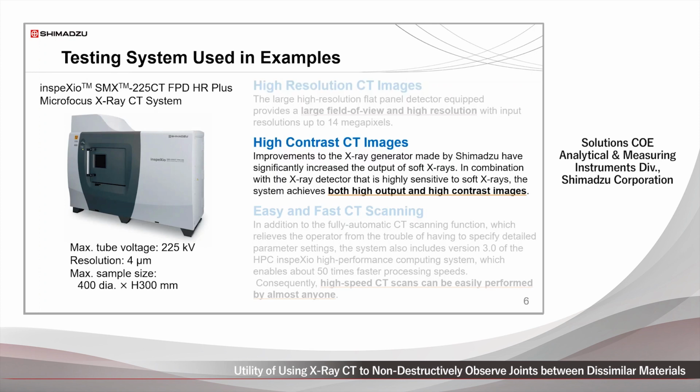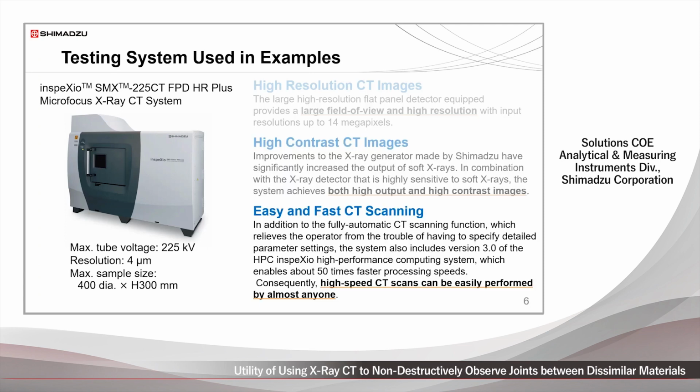The second is the high output and high contrast images enabled by an X-ray generator that generates a large amount of soft X-rays in combination with a detector that is highly sensitive to soft X-rays. The third key feature is the new fully automatic CT scanning function with the high-performance computing system that ensures almost anyone can easily perform high-speed CT scans.